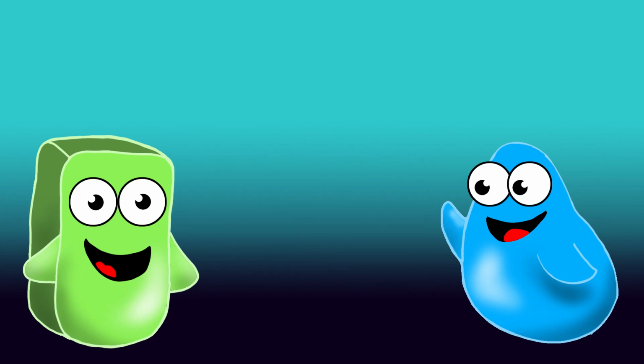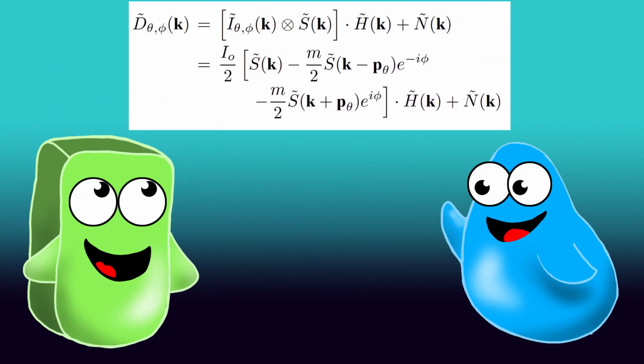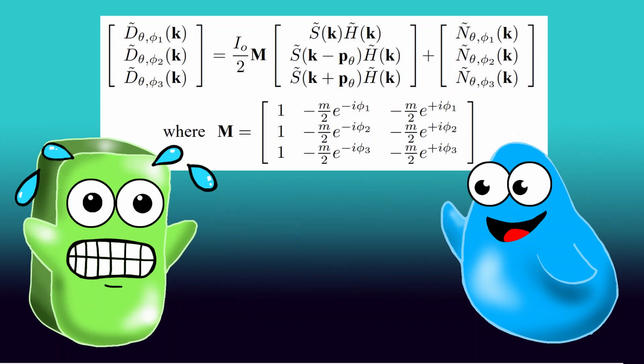The moire patterns in each of the 9 images contain hidden information. Special mathematical algorithms are used to translate the moire patterns into a high-resolution image.